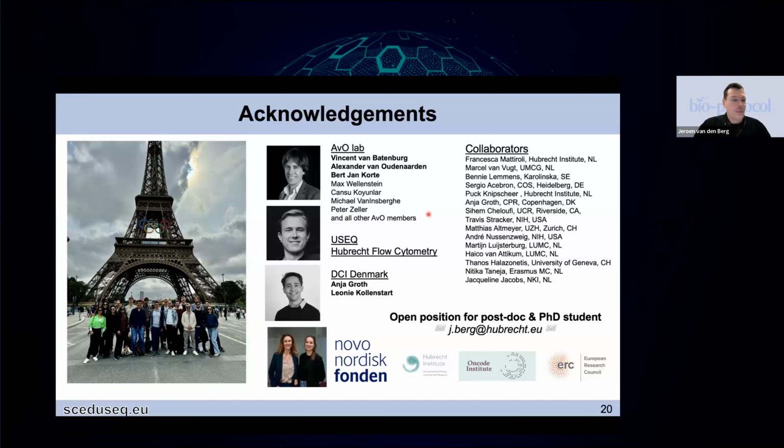Okay, great. So there's a question I've been reading a lot, especially on the website, but also here just now in the chat, which is how does single-cell EdU-seq compare to the standardized technique of DNA fiber analysis? And are there positives, negatives, or big differences between these techniques? Well, there's a couple of things you can't measure with EdU-seq, and a couple of things you can't measure with a fiber. So in that sense, they're complementary.